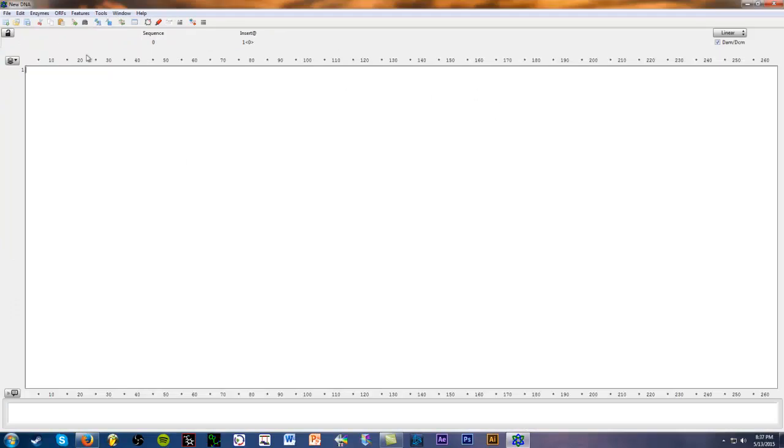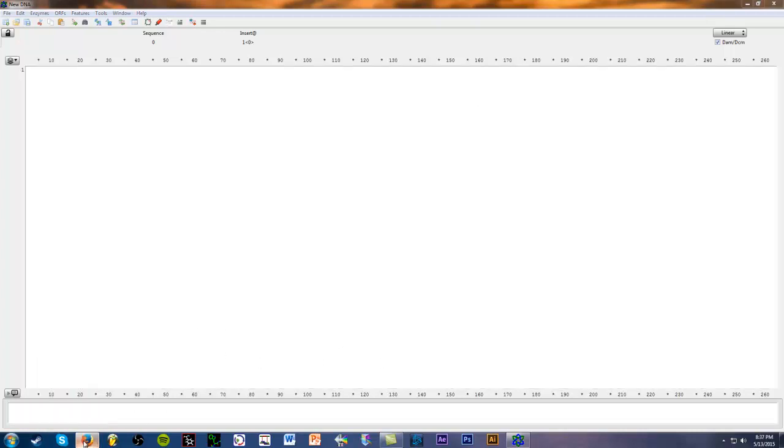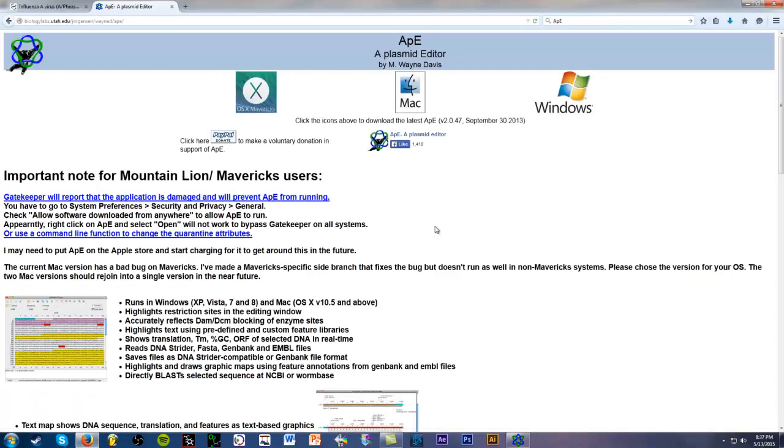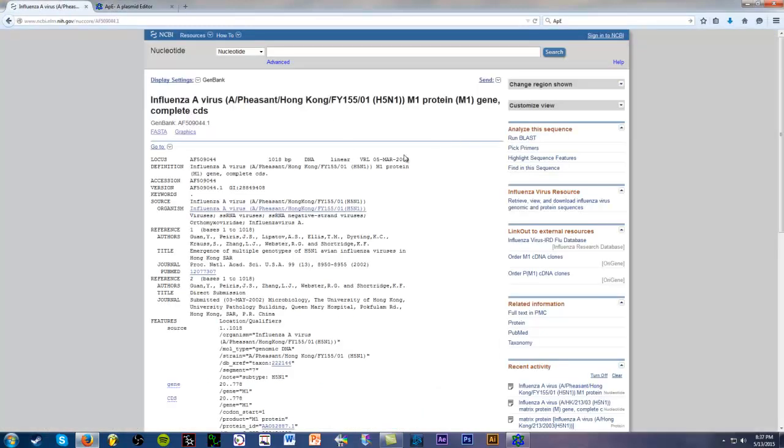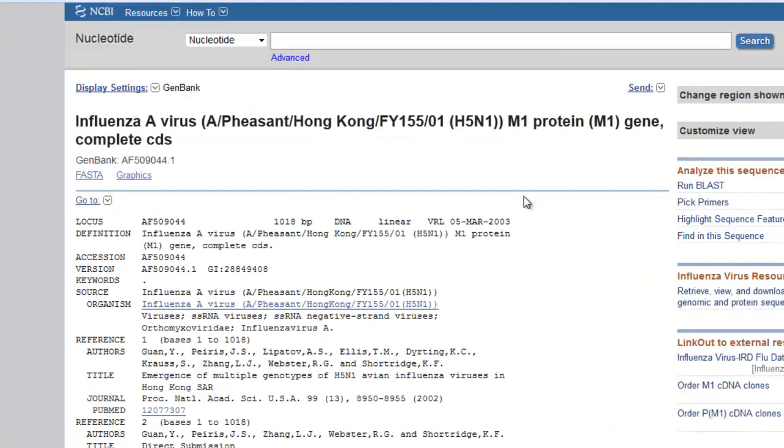Okay, great. Now this is the user interface of this program, and to get started, we just need to get a DNA sequence. So I have already picked one out, and it's kind of random.